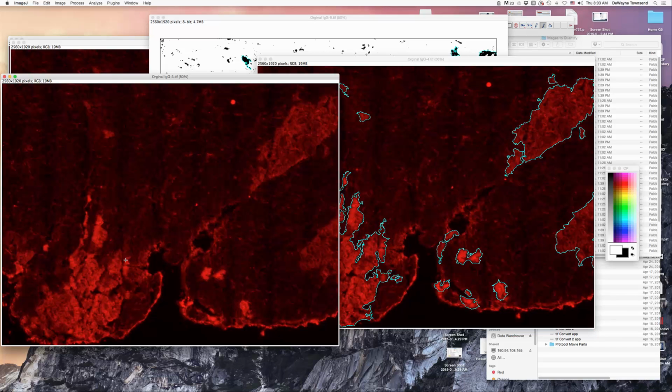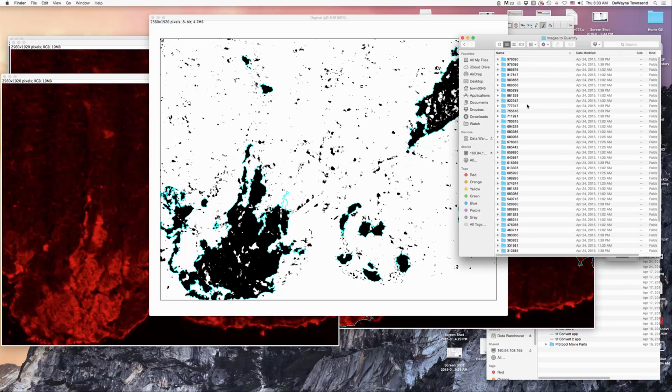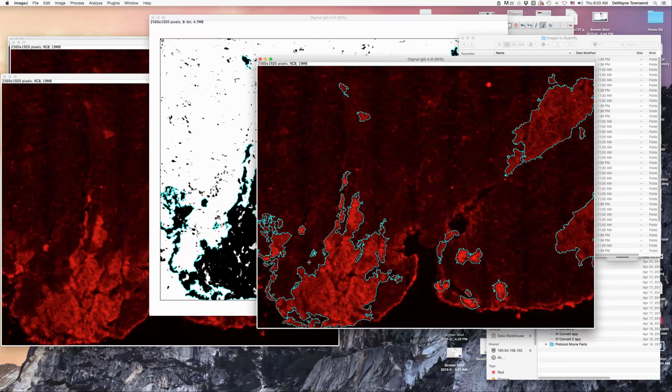We might come up here and say, you know what, this area on the top here is probably not positive. So we can get rid of this stuff coming down to say there. Okay. And then let's see. Whoops. Wrong image. Alright, so here we go. So this looks all good. Matching it up over here. Comes down. We got an area here.